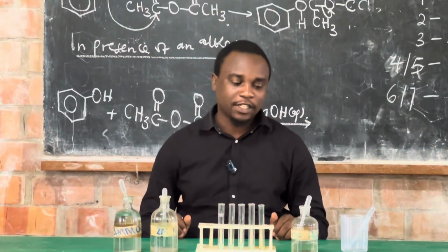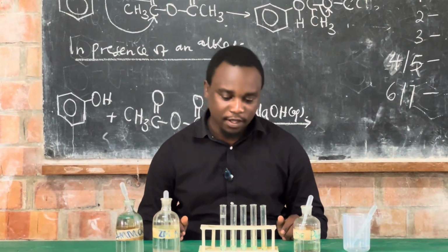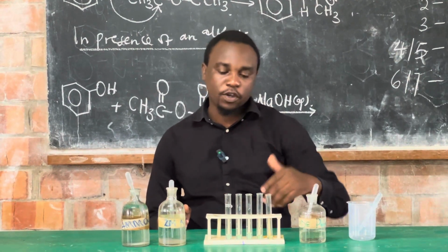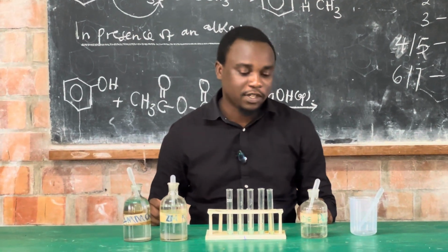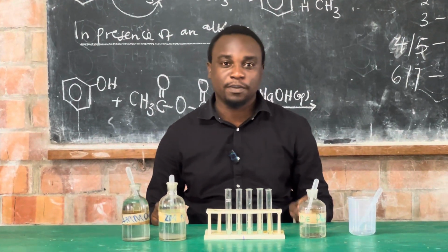Today, we are going to look at testing for copper 2 ions in solution. And here with me, I'm having test tubes which we presume are containing copper 2 ions, and we shall see what happens or what takes place when we are to confirm or test for copper 2 ions.